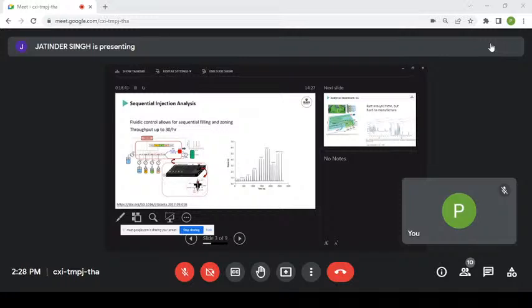Here we've got a familiar feature again, our little serpentine, because we want our sample to be mixed with the two reagents. The reason this sample plug is put in the middle is because there's less distance to mix with both bits of reagent. So these three mix in that serpentine together. You can see it, mixer.